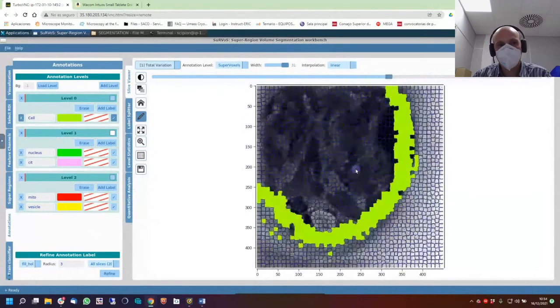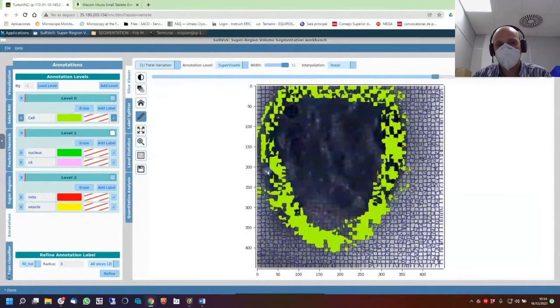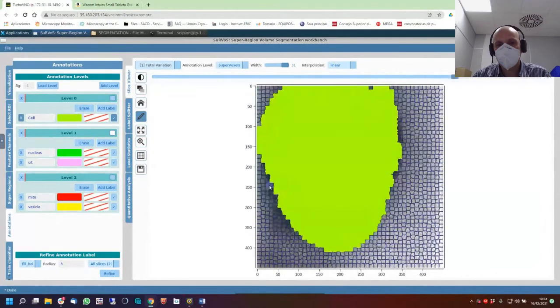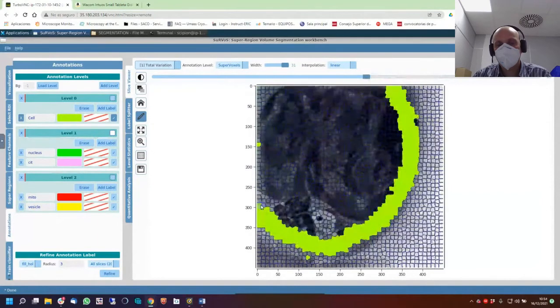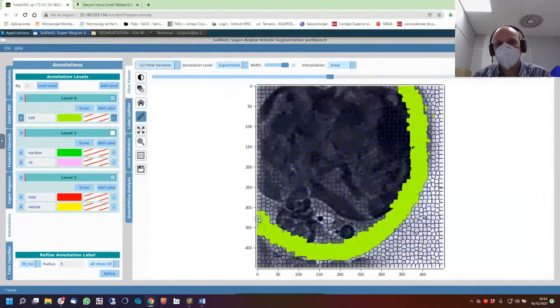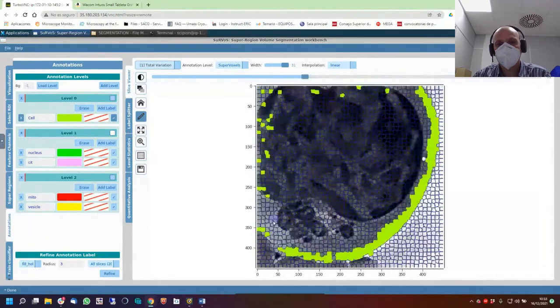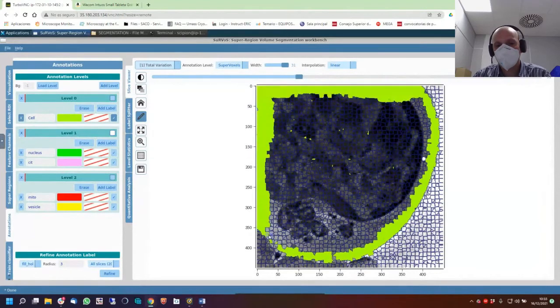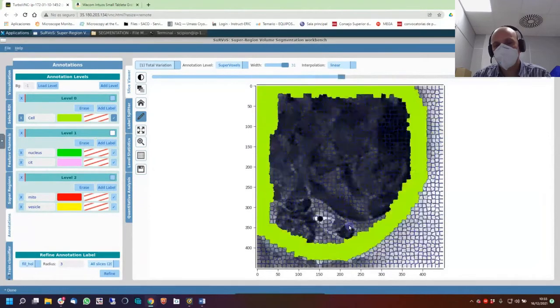So click again to here, try to do it like that. Going like that. Going the other direction. Okay. And you see that it's broken, so be sure to also fix it.